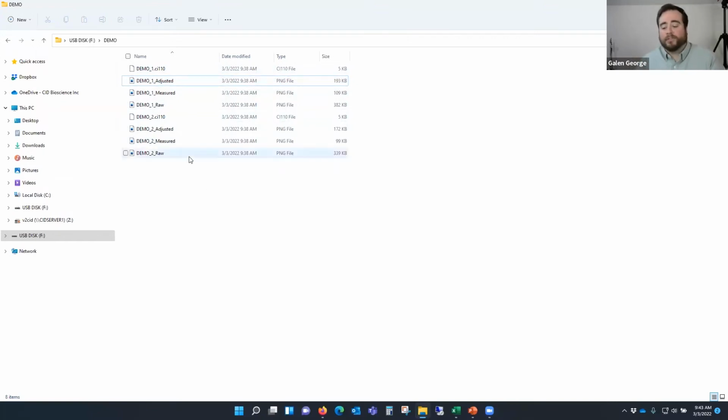It's just an Excel spreadsheet that has your PAR LAI, your gap fraction LAI, your sun flex, your canopy density, all your date and time, location, all of those calculations, leaf angle, those will all be in a CSV file from the instrument.